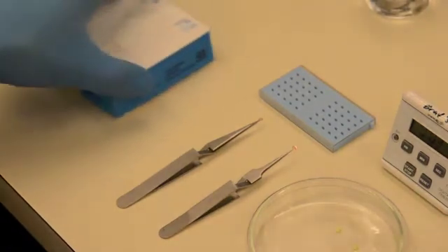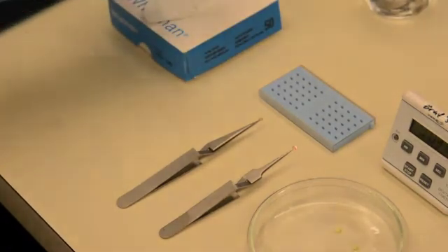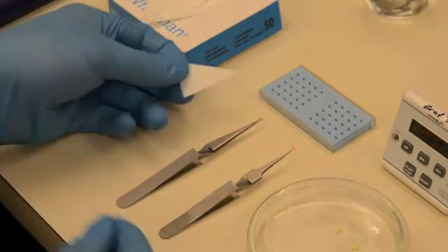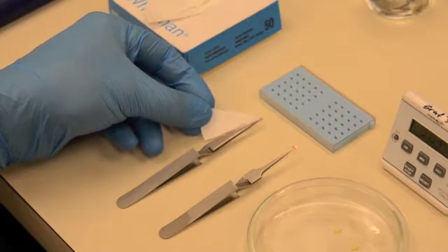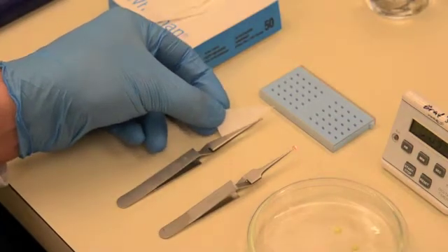Once the grids are washed, dry them using a triangle of filter paper. Gently brush the filter paper alongside the grid, being very careful not to rub the grid or push it off the forceps.